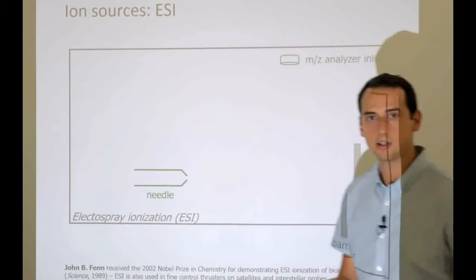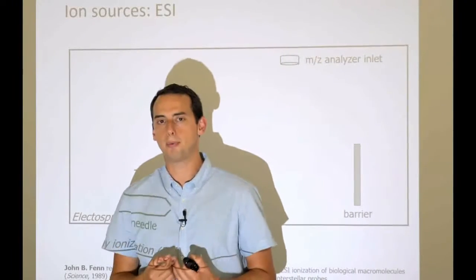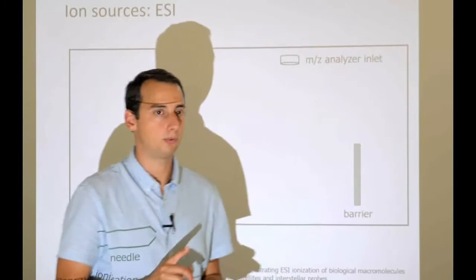Okay, so we've got MALDI covered now. Now, MALDI isn't used that much anymore because of the problem I talked about earlier. It's very difficult to automate MALDI. Instead, this method is much more used.